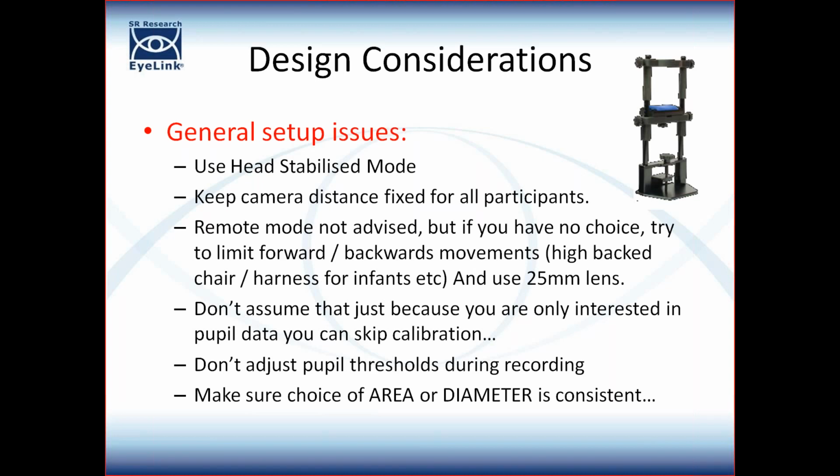But also what happens is as you go further away from the camera, the amount of infrared reaching your eye is less, the eye becomes darker, so maybe more pixels on the pupil are thresholded. Or as you become closer to the camera illuminator, everything gets brighter, maybe fewer pixels are thresholded. It will, at the very least, add an awful lot of potential variability to your data.